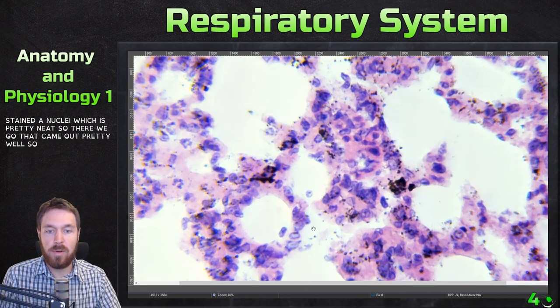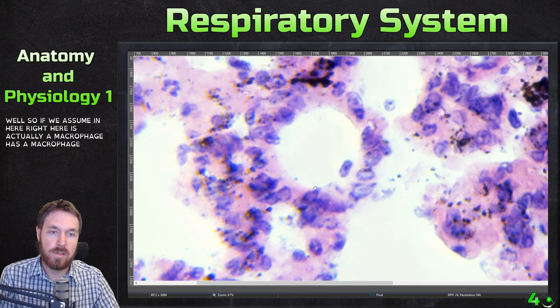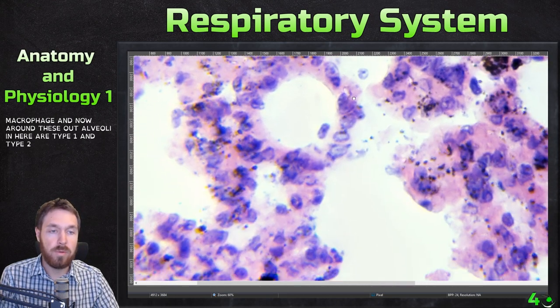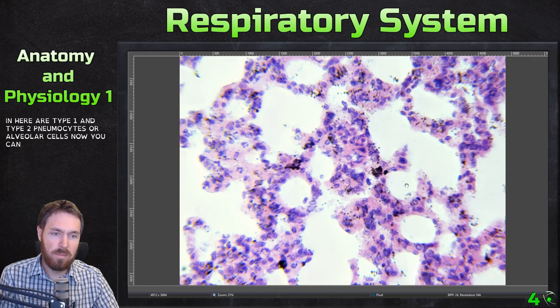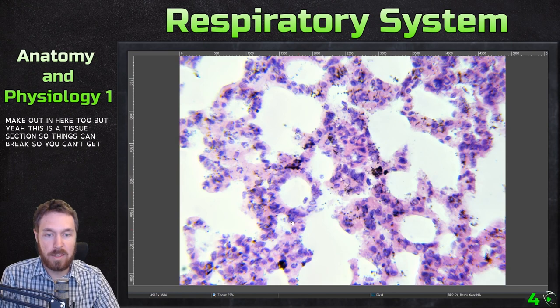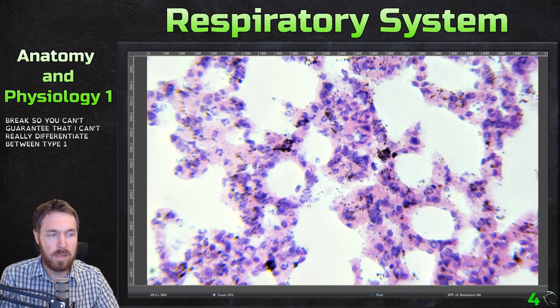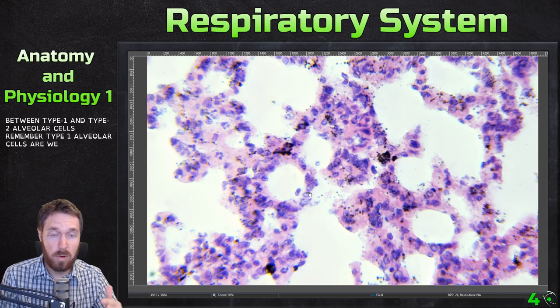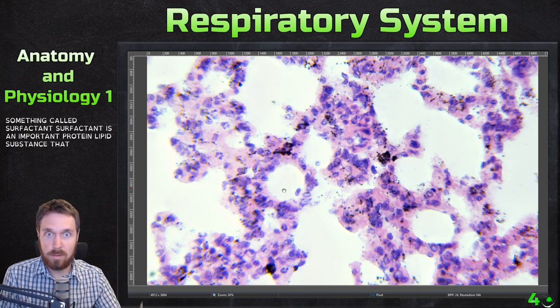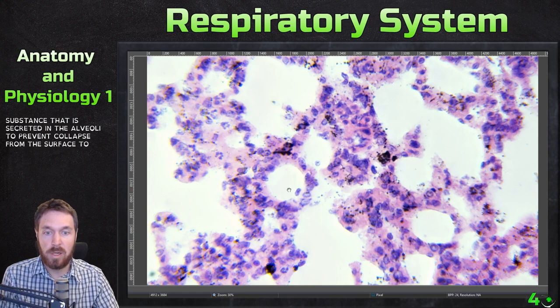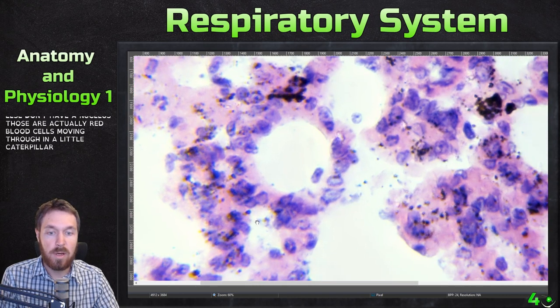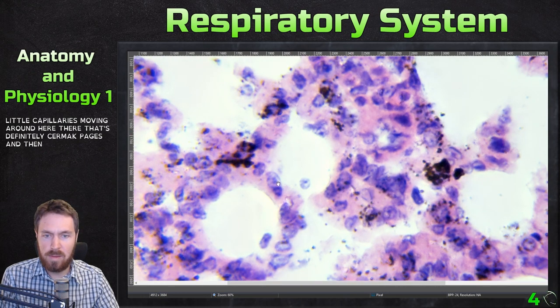The stacked image came out pretty well. Zooming in: right here is actually a macrophage — an immune system patroller — and there's another macrophage. Around these alveoli are type 1 and type 2 pneumocytes, or alveolar cells. You can make out some alveolar pores too, though in a tissue section things can break so you can't guarantee them. Type 1 alveolar cells are where most diffusion of gases takes place; type 2 alveolar cells produce surfactant — an important protein-lipid substance secreted in the alveoli to prevent collapse from water's surface tension.